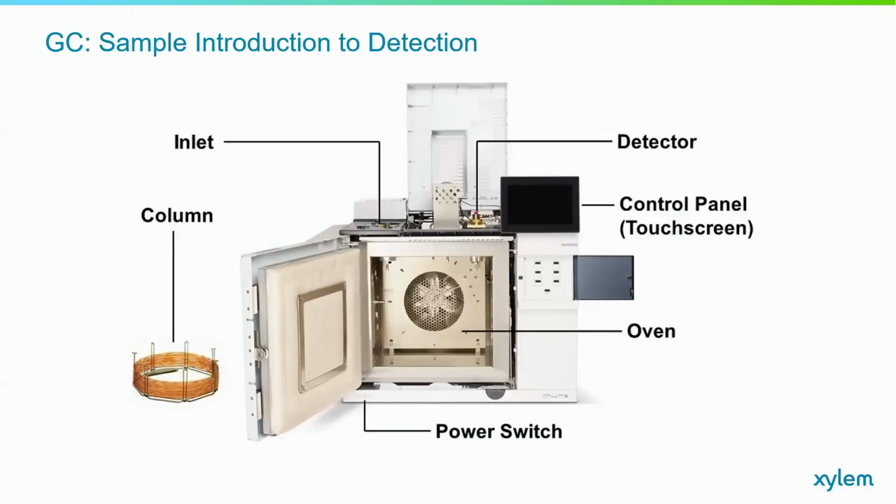What you can do from there is check your chromatogram against existing chromatograms to determine what is present specifically within a sample. You could also do further mass spectrometry to further speciate compounds. We won't be talking about MS in this presentation, but that is another analytical tool that's often paired with GC analysis.